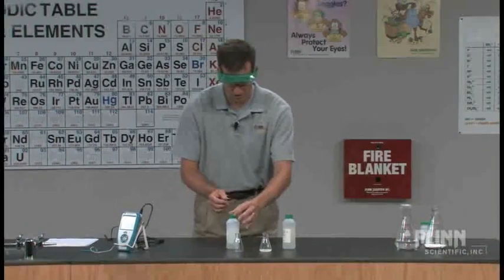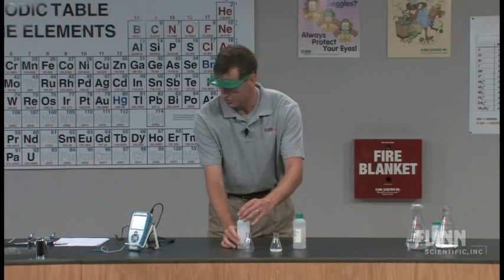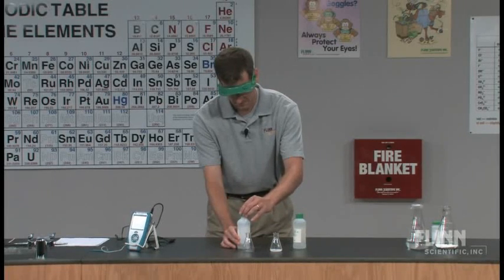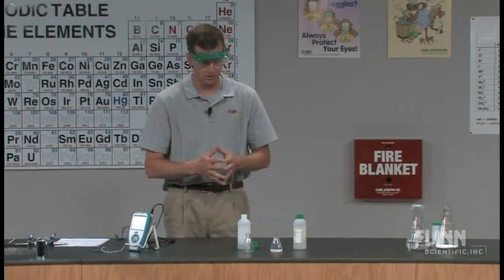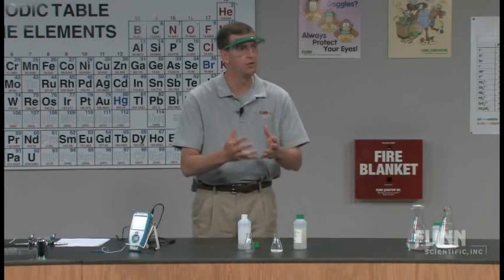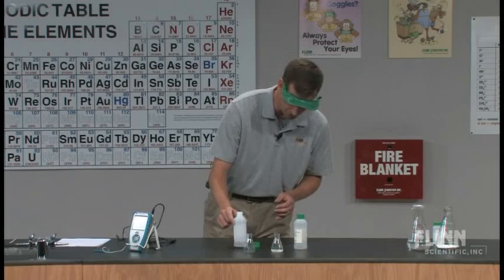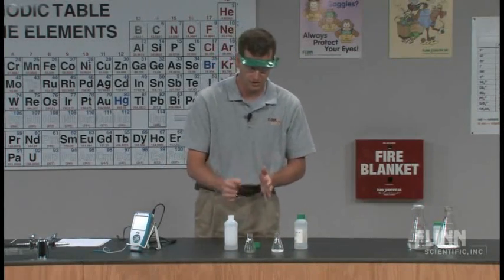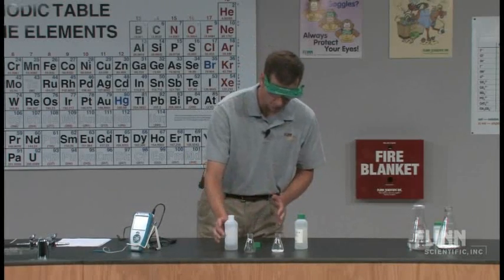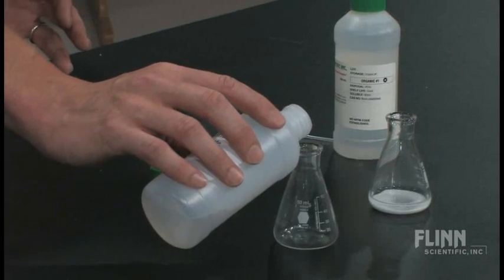We wouldn't give them any answers yet. Then we would pair that up with the next reaction. I've got a saturated solution of sodium acetate. In the handouts, it will give you the instructions for how to make the supersaturated sodium acetate. You have to do it carefully and make sure that you let it cool down relatively slowly so that it doesn't go back to crystal form. Now I'm going to attempt to pour this sodium acetate into this flask. As I pour this, it may go to a solid state.